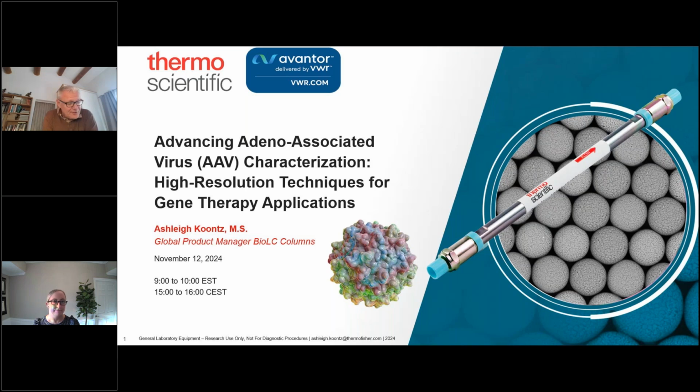And today we have the pleasure to present a webinar called Advancing Adeno-Associated Virus Characterization, High Resolution Techniques for Gene Therapy Application. Ashley Kunz from Thermo Scientific will delve into cutting-edge methodologies for the precise characterization and quantification of AAV samples, focusing on the use of high-resolution size-exclusion chromatography and strong anion exchange chromatography.